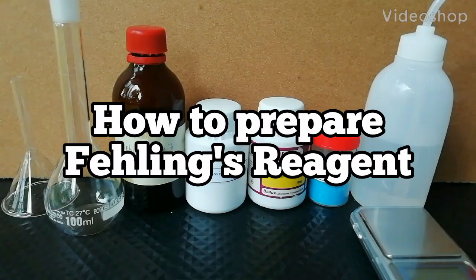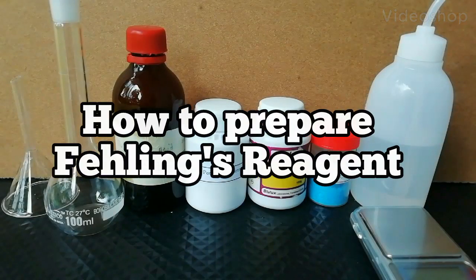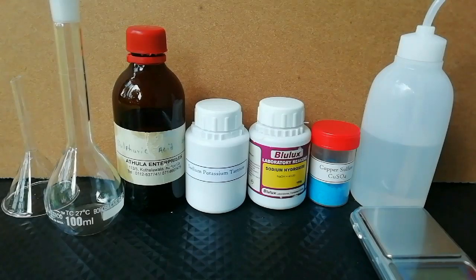In functional group tests, we use Fehling solution to identify aldehydes. In this video, I am going to show you how to prepare Fehling solution.